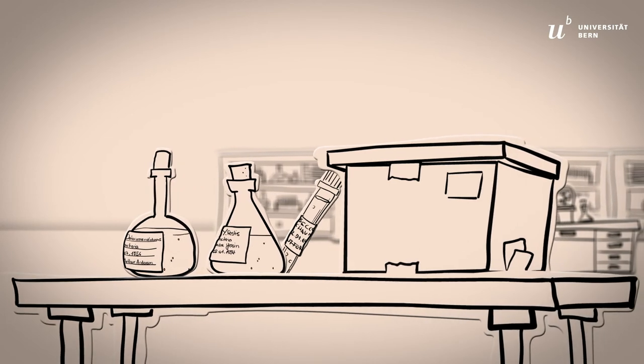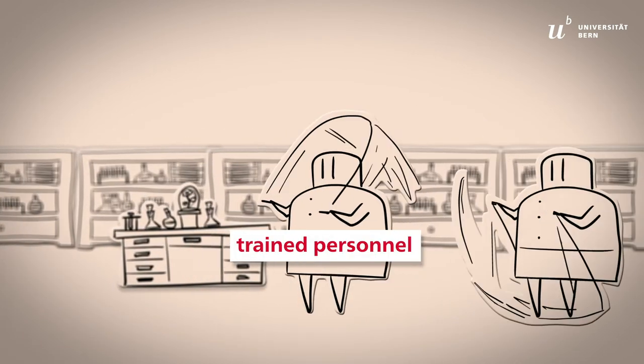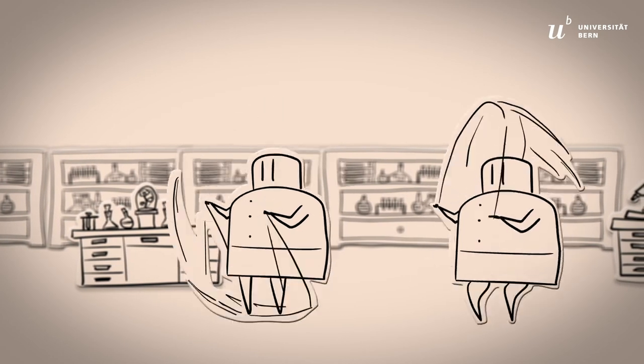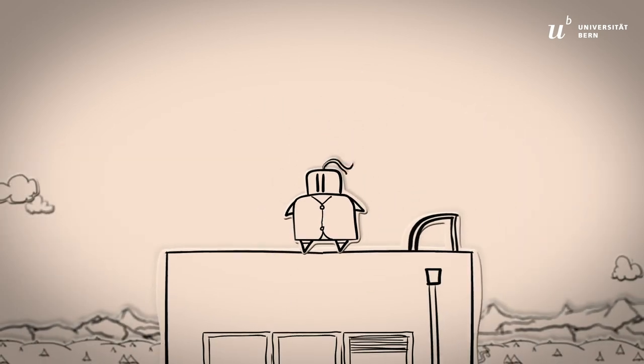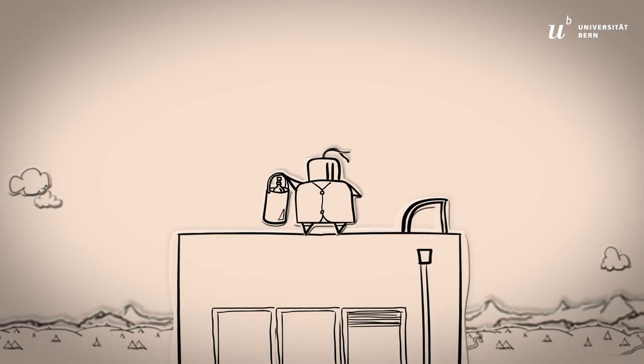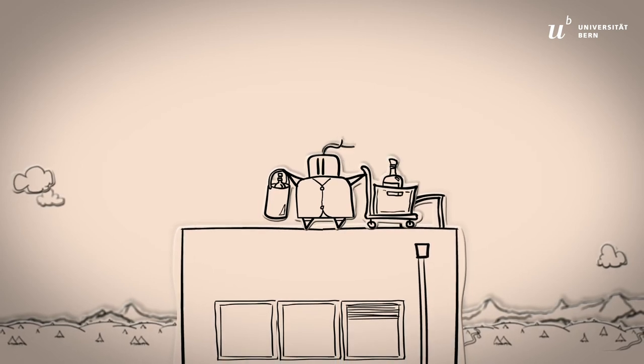When chemicals need to be transported, only trained personnel are allowed to do so. For transport inside or between buildings, place the sealed and labeled container in a hand basket or in a box on a hand cart.